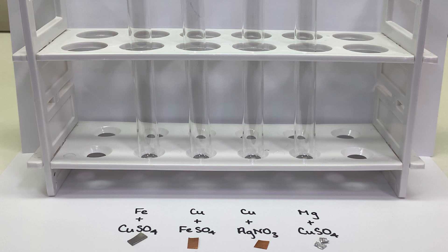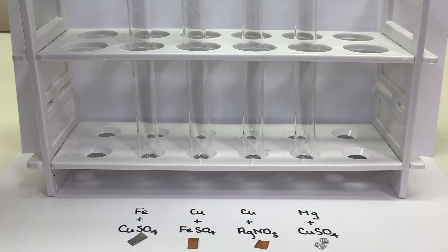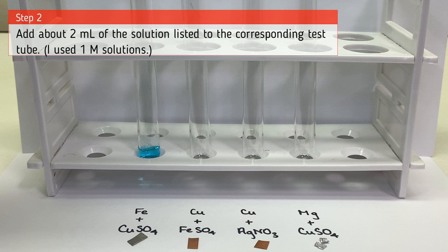Now we are going to attempt four different chemical reactions. The first one is iron metal mixed with a copper sulfate solution. The second is copper metal mixed with an iron 2 sulfate solution. The third is copper metal mixed with a silver 1 nitrate solution. And the fourth is magnesium metal mixed with a copper 2 sulfate solution.